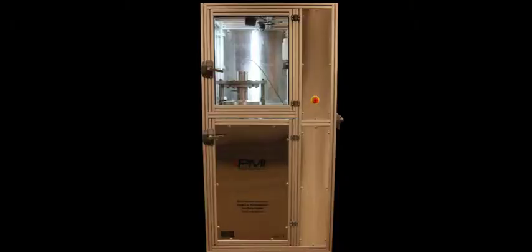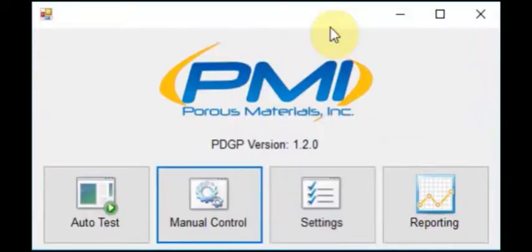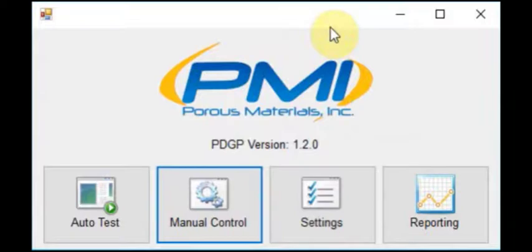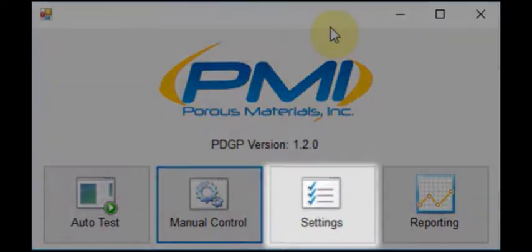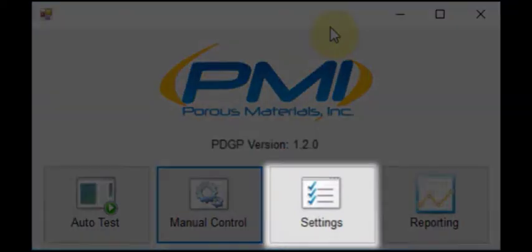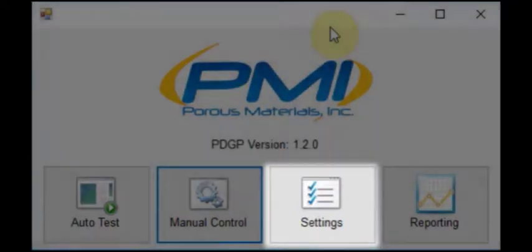We will now cover use and operation of the PMI APDP-HP101 software package, developed by PMI exclusively for this instrument. When the program is run, this is the first window the user will see. From this window you can select auto-test, manual control, settings, and reporting. For now, we will navigate to the settings menu.